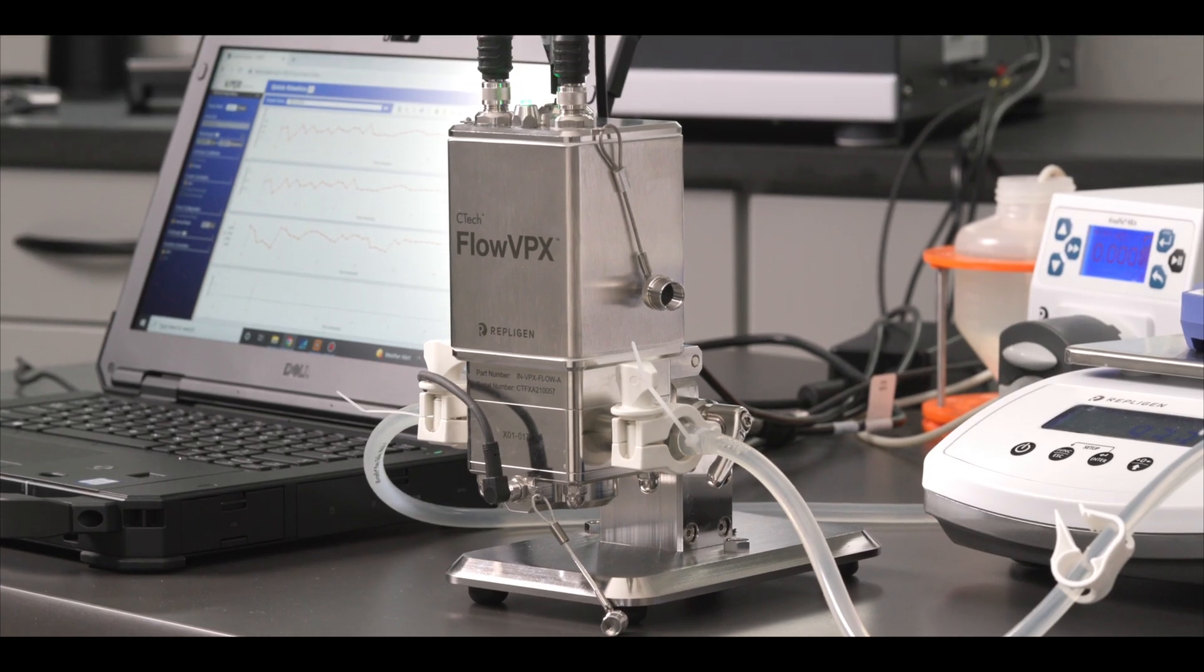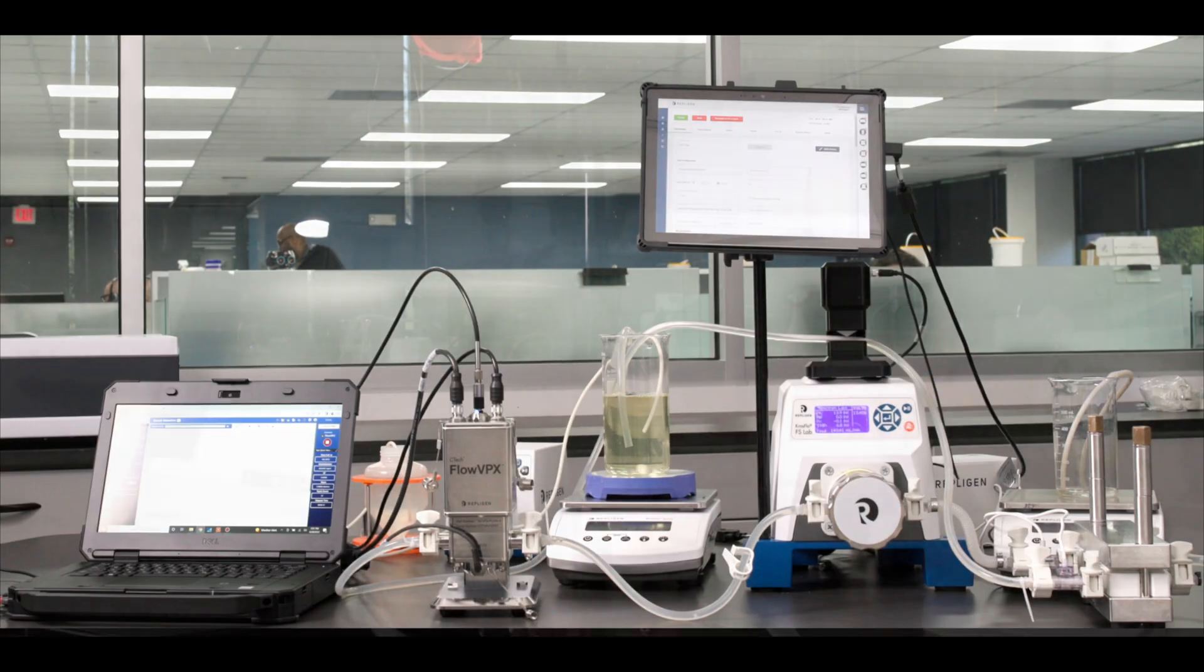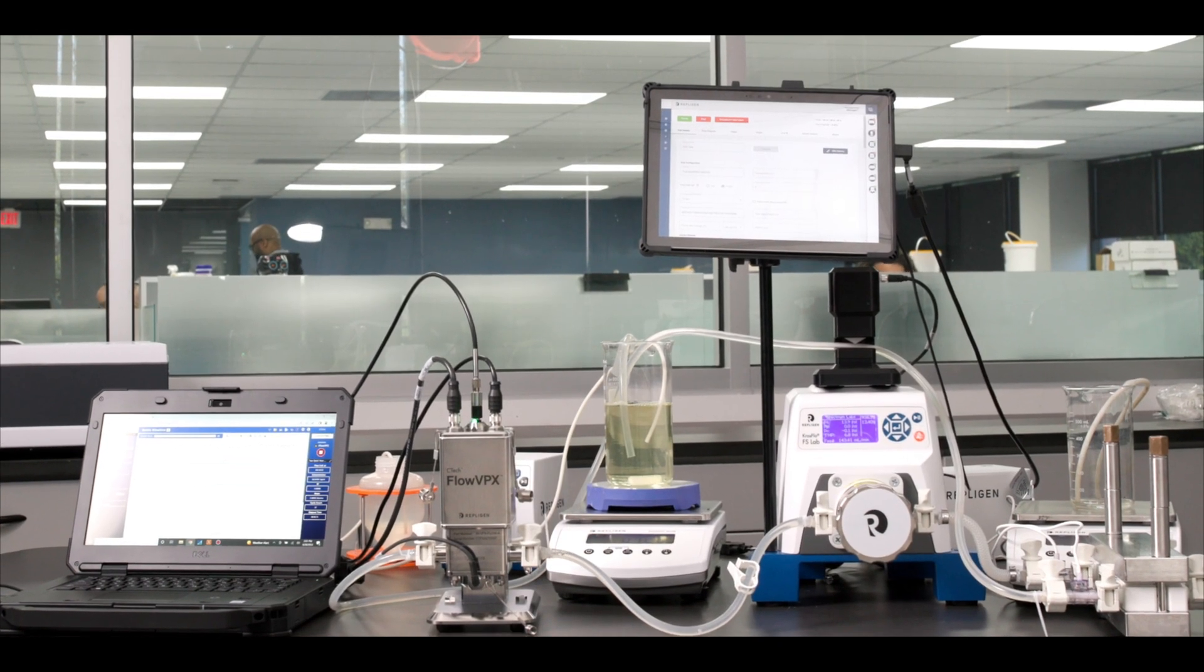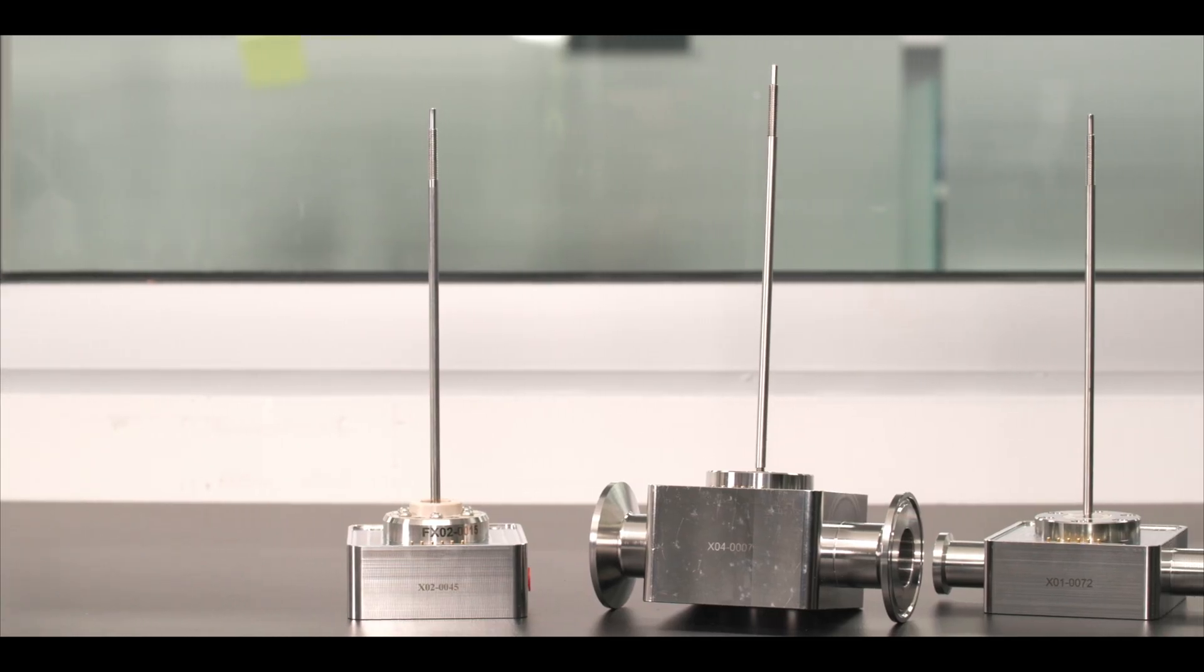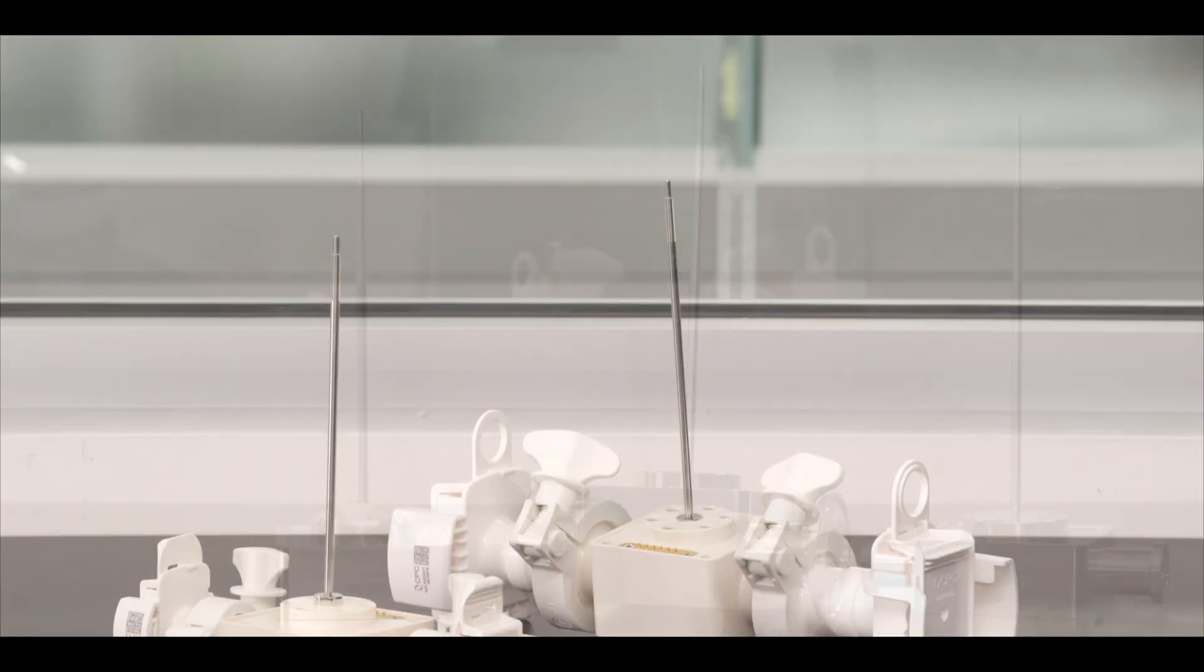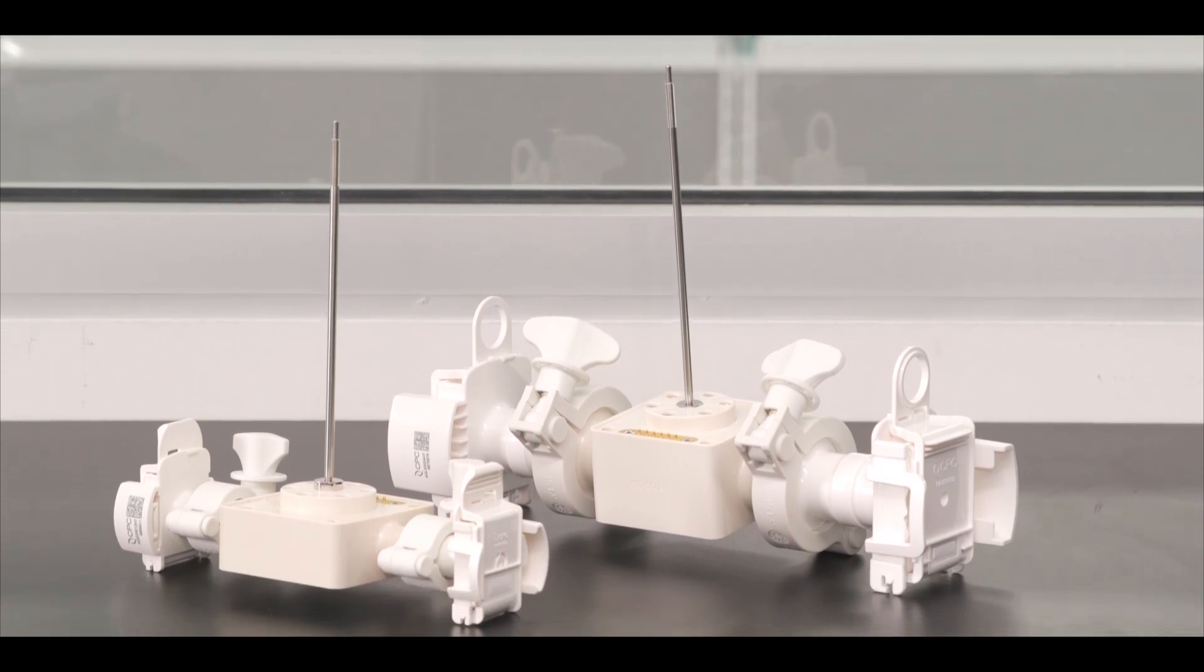The CTEC FlowVPX system works inline directly into your downstream process, creating a measure of control previously unheard of. The FlowVPX system offers low-maintenance stainless steel flow cells as well as single-use disposable flow cells to tailor to your lab and GMP needs.